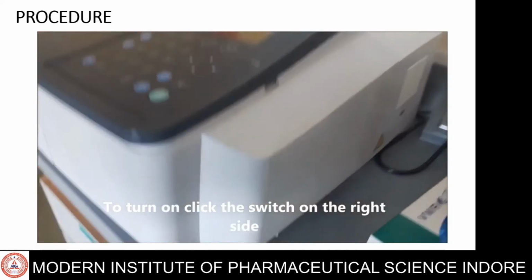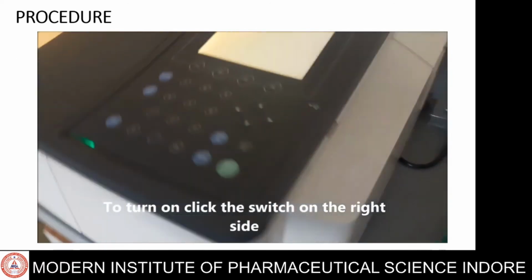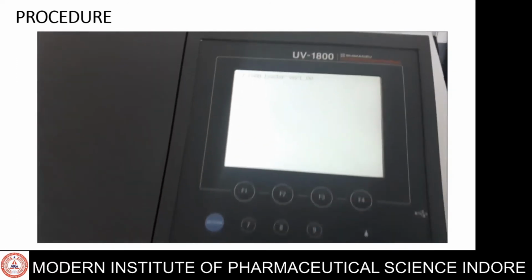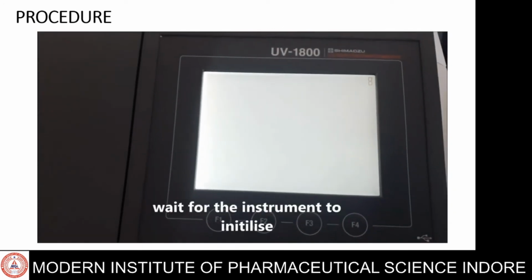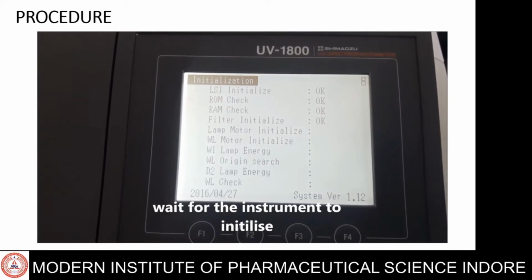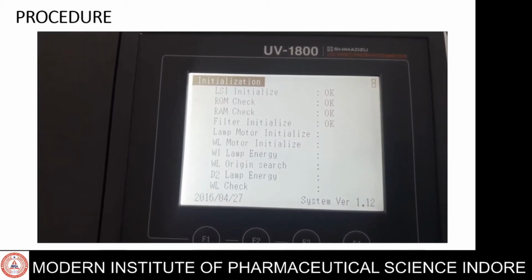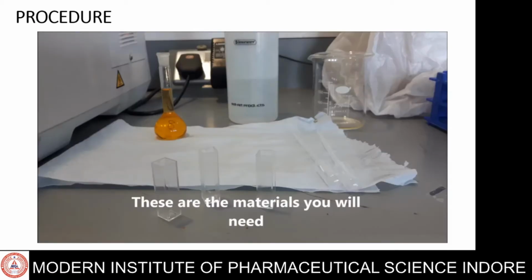First, to turn on, click the switch on the right side. Wait for the instrument to initialize. We have to do baseline correction using the solvent which is used for taking absorbance of any drug.